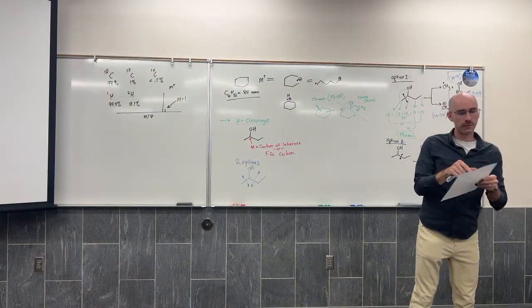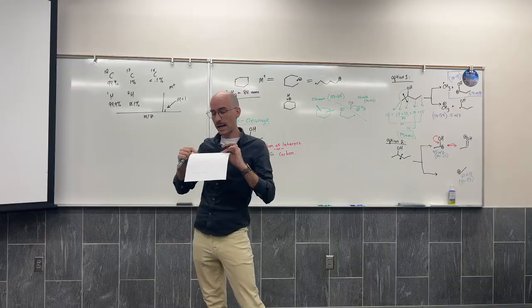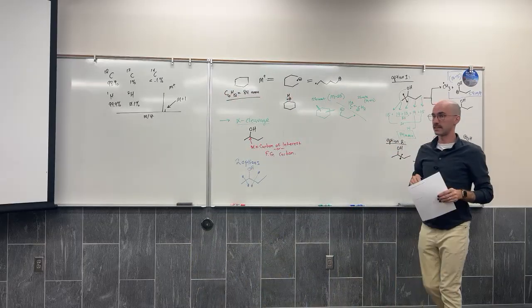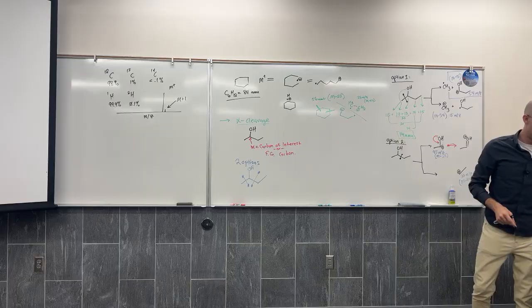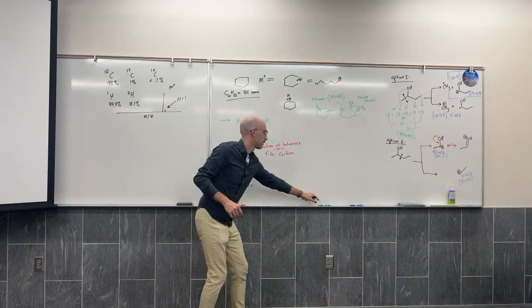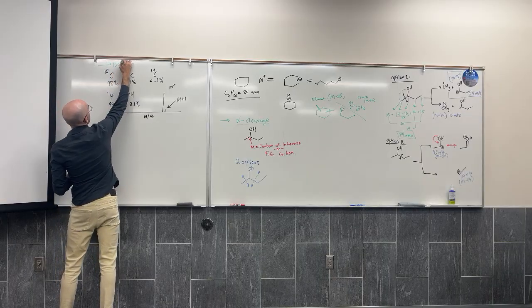There is an M-1, and we saw that for the sec-butyl alcohol. It looked like an M-1. That's not as common. That's not an isotopic cluster. That's the loss of an atom. Okay, and sorry, this is under isotopic clusters.